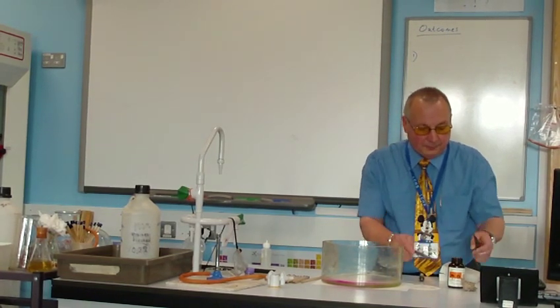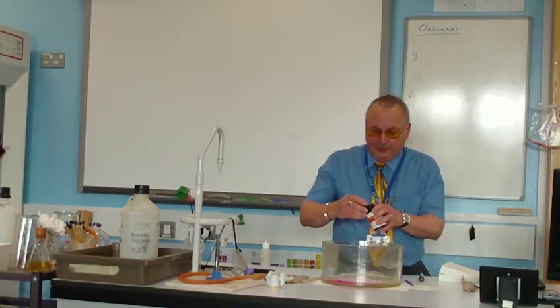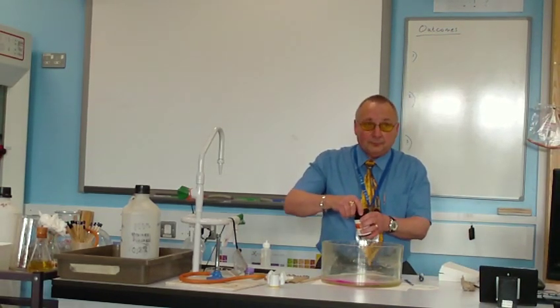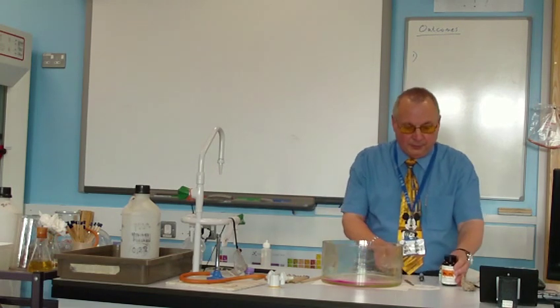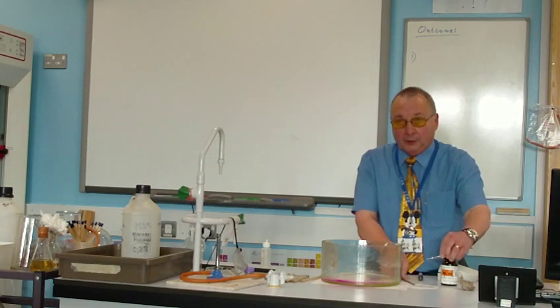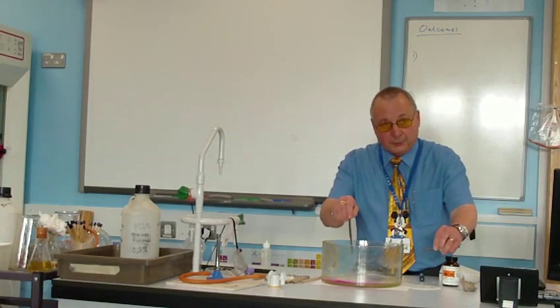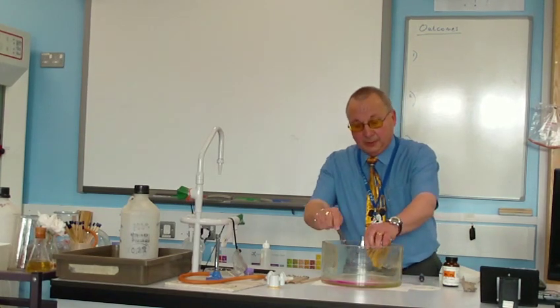Put it in cold water, run it under the tap for a long while, yes? Because it cools things down. But this piece of sodium isn't going to be cooled down as much as the other one, because it's not going to go all round the water. It's going to be restricted by this paper.